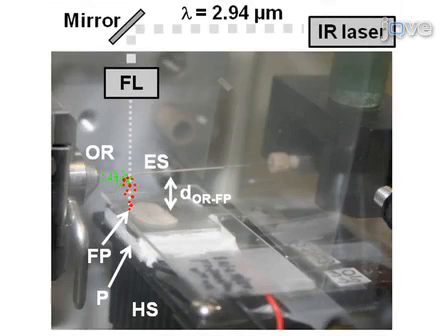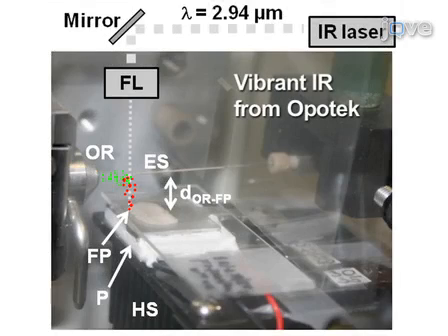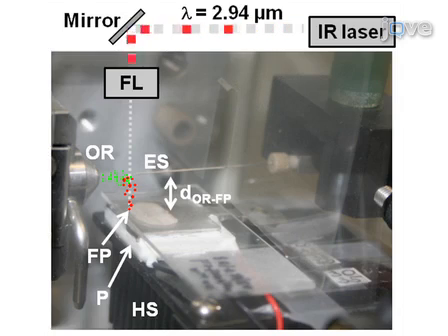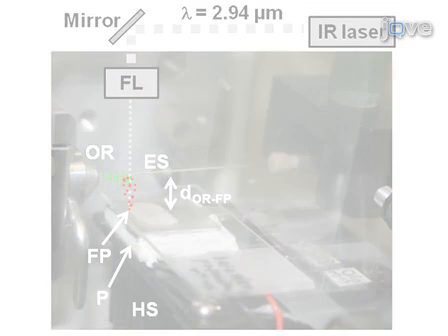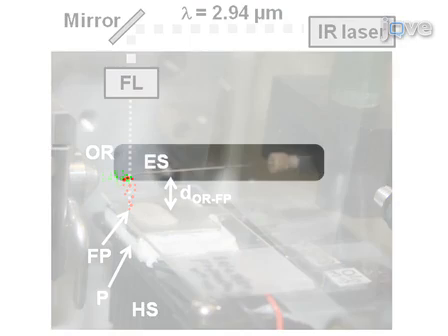The laser ablation electrospray ionization, or LAESI ion source, consists of a mid-infrared laser, abbreviated mid-IR, and a series of optical elements for light steering and focusing. The setup also includes additional sample holders, cooling components, translation stages, and an electrospray system.